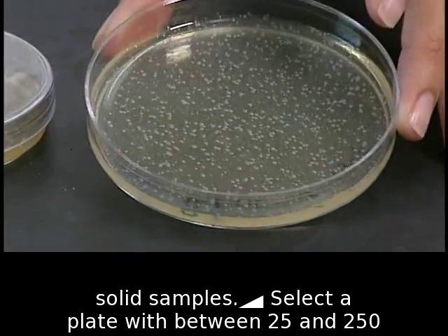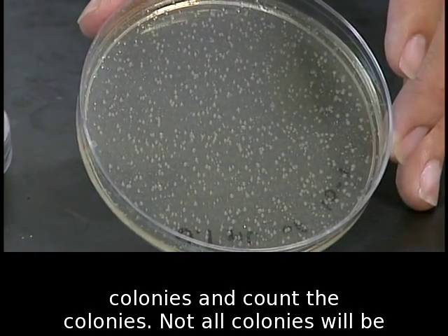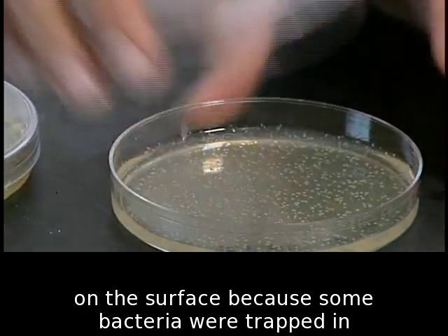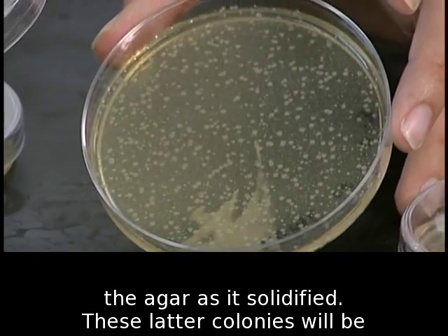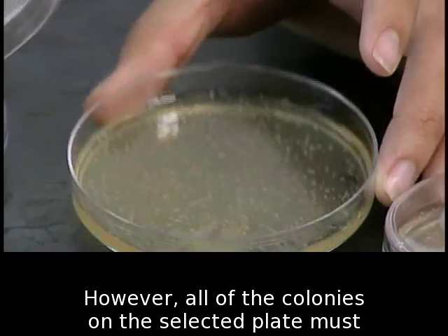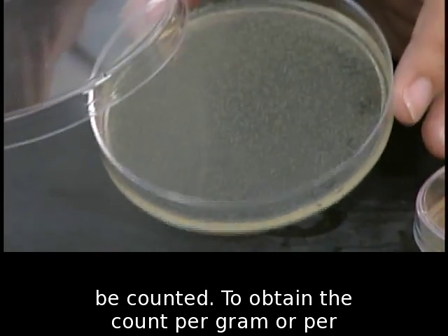Select a plate with between 25 and 250 colonies and count the colonies. Not all colonies will be on the surface because some bacteria were trapped in the agar as it solidified. These latter colonies will be noticeably smaller than the ones on the surface. However, all of the colonies on the selected plate must be counted.